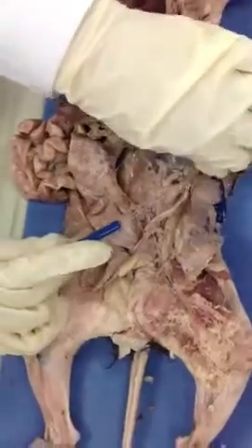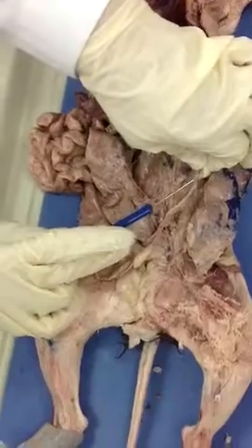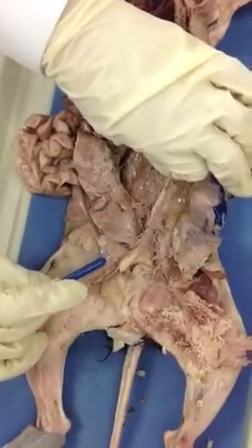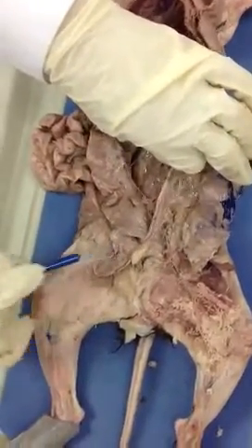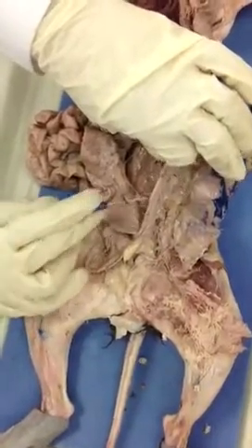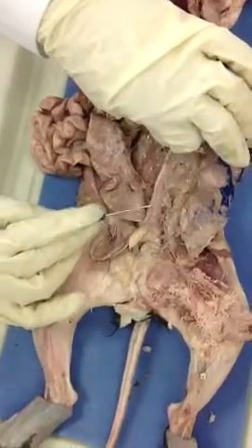Broad. Now here I see this kind of bean-shaped organ. What is this here, please? Ovary. And then this tube, what's this tube? Uterine horns, right? Remember that in the cat they are going to be longer because they hold the kitties here, right?